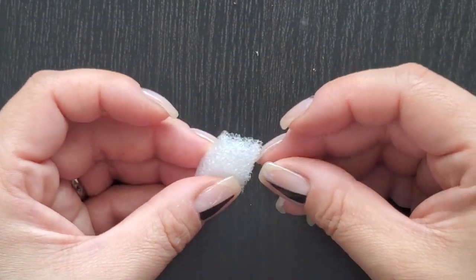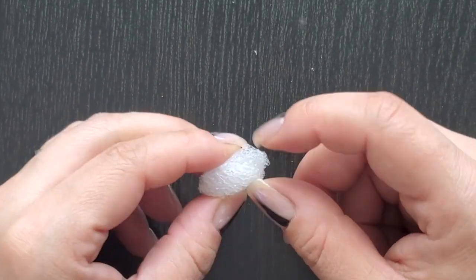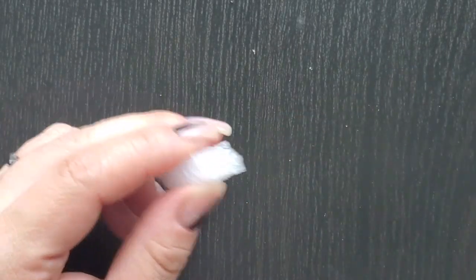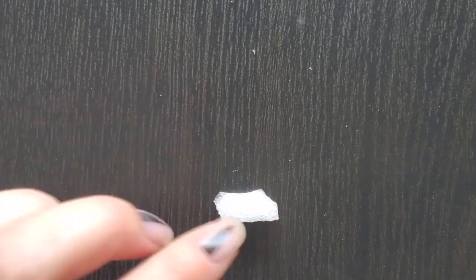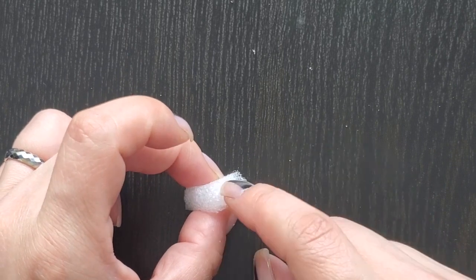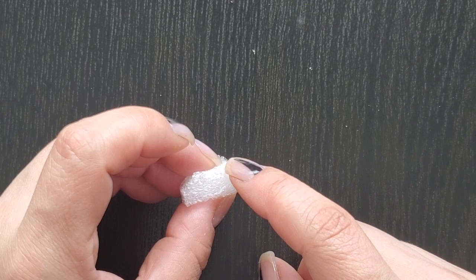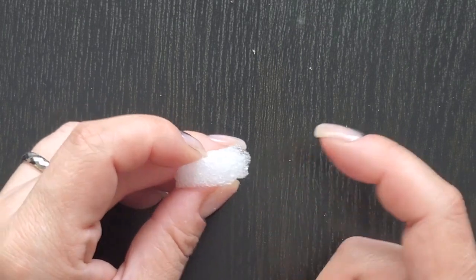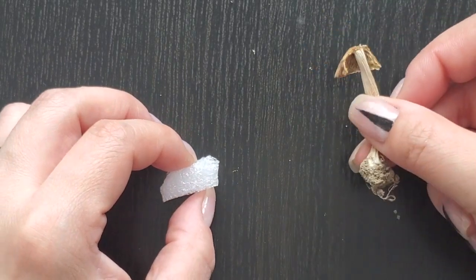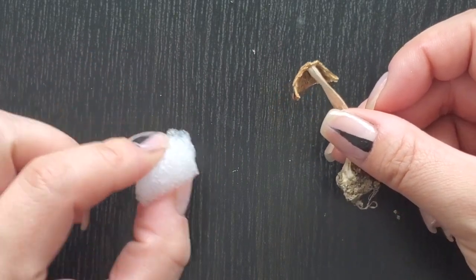So the first method requires you to use Styrofoam. Now this is very porous. This is not ideal. You would like something much more dense, like a Styrofoam peanut. This is all I had. So I'm just going to show you how to do this, but I'm not actually going to follow through with the sectioning because I cannot get good sections with this right now. Because this is not ideal, and the fruiting bodies that I have are quite delicate, I would prefer to use my other method, but I'll show you how to get started with this one anyway.